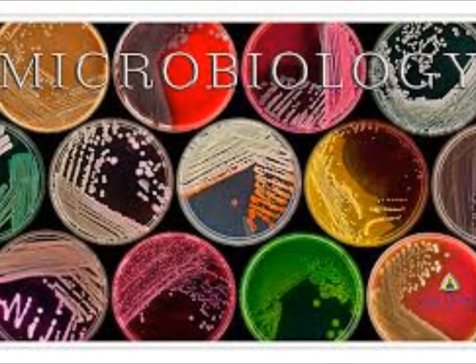Surface appearance, so you might get colonies that have a wet sheen or a shiny sheen to it, which a lot of our gram negatives do. They almost look like a puddle of water. Or a very dull looking colony where there's no sheen to it at all. They can be wrinkled. Metallic, that's another characteristic of Pseudomonas aeruginosa. When you have a plate that has a gram negative on it and you hold it in the light, it has a sheen to it and looks like a piece of metal. That's very characteristic of Pseudomonas aeruginosa. There's not any other organism that has that metal sheen.